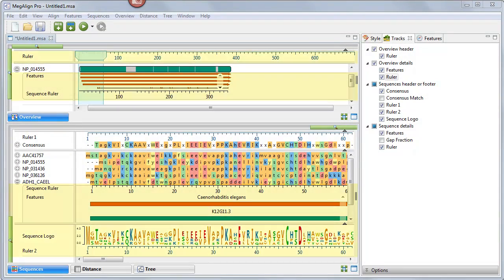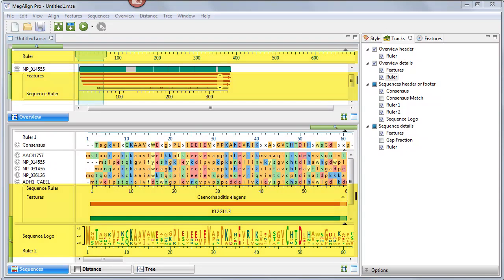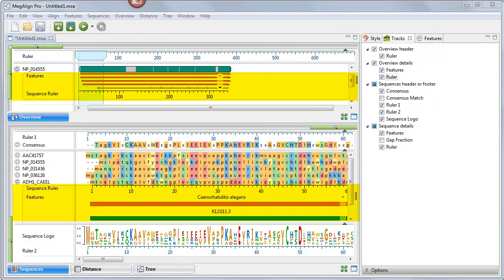Detailed tracks are rows of information that can be displayed or hidden as desired in the Overview and Sequences view. The header, footer, and individual sequence rows can each display certain types of tracks.